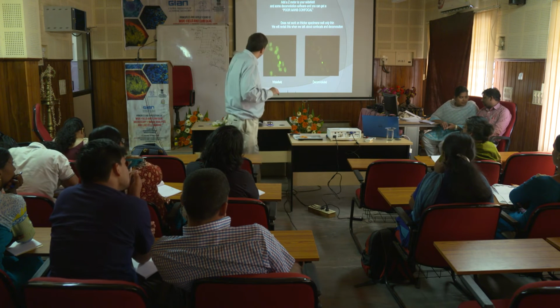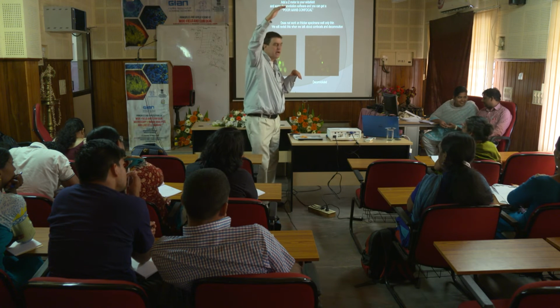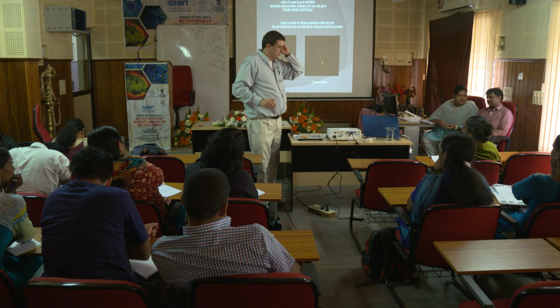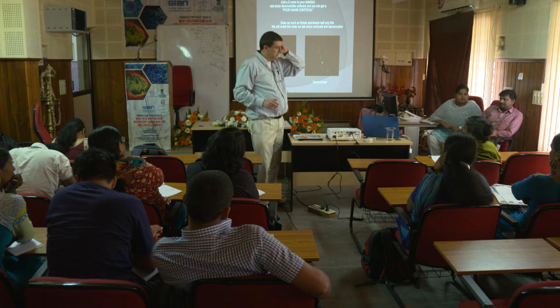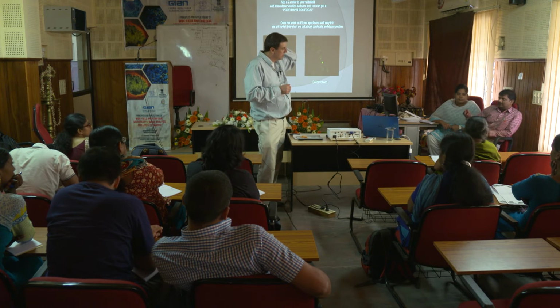Because if you use a lot of the dynamic range of the camera, if you can get your signal up to high numbers, then what you could do is, we'll do a little bit here, and this probably wouldn't be a bad time to talk about scaling in MetaMorph actually. So we've got a few more minutes. I can go back to the image analysis stuff for a few minutes.